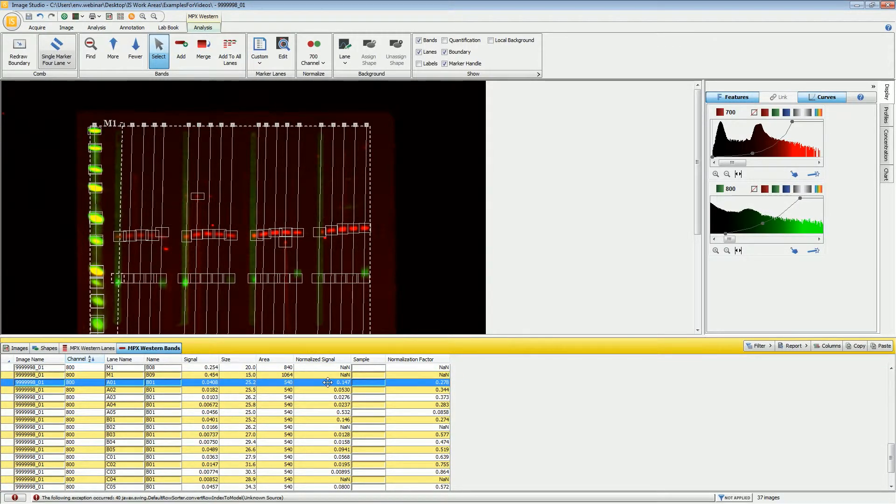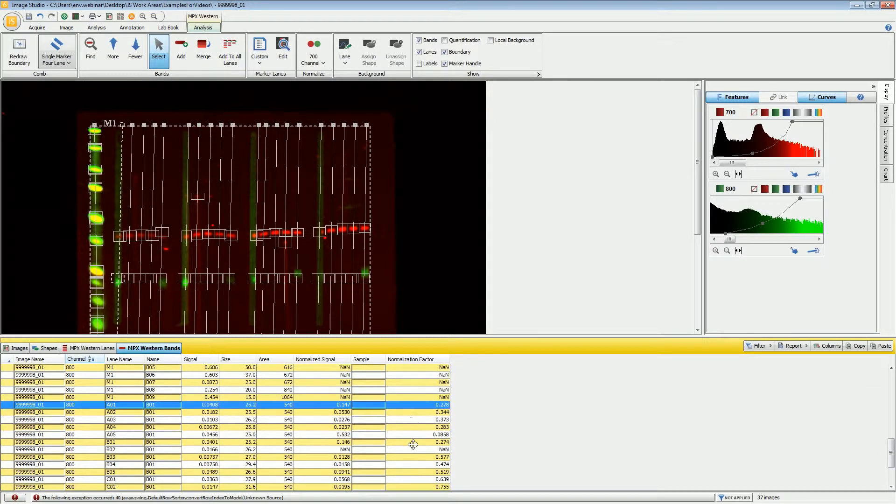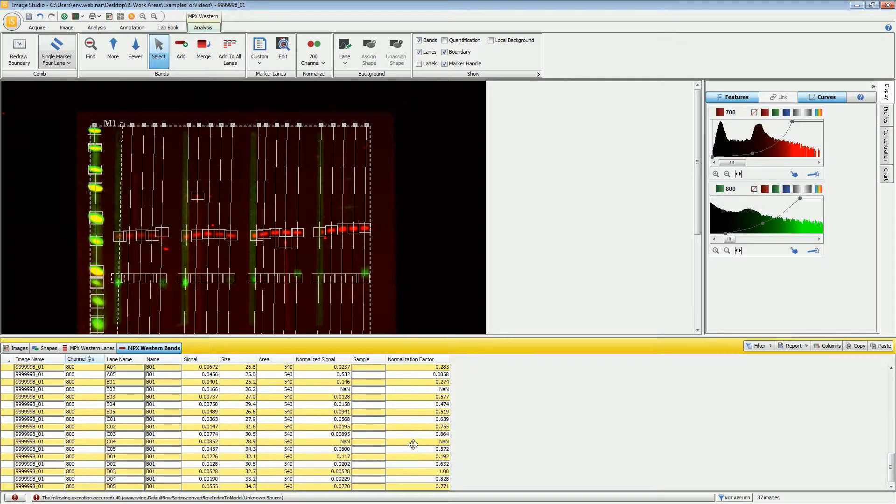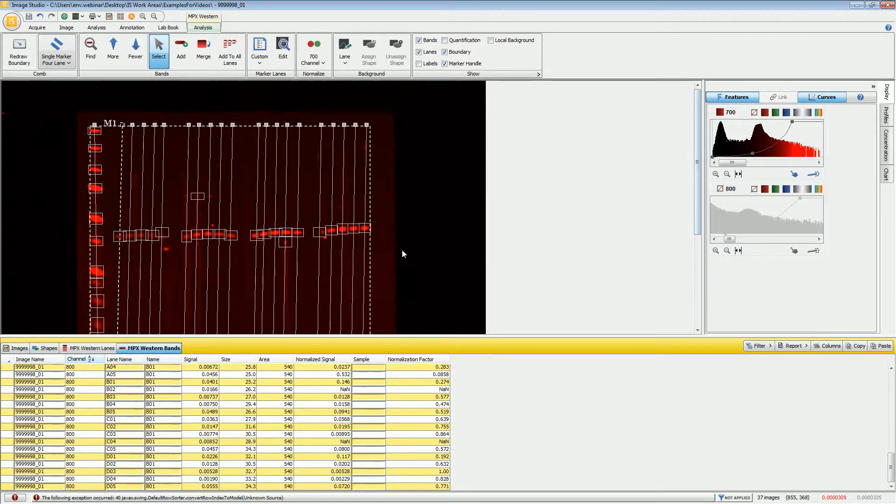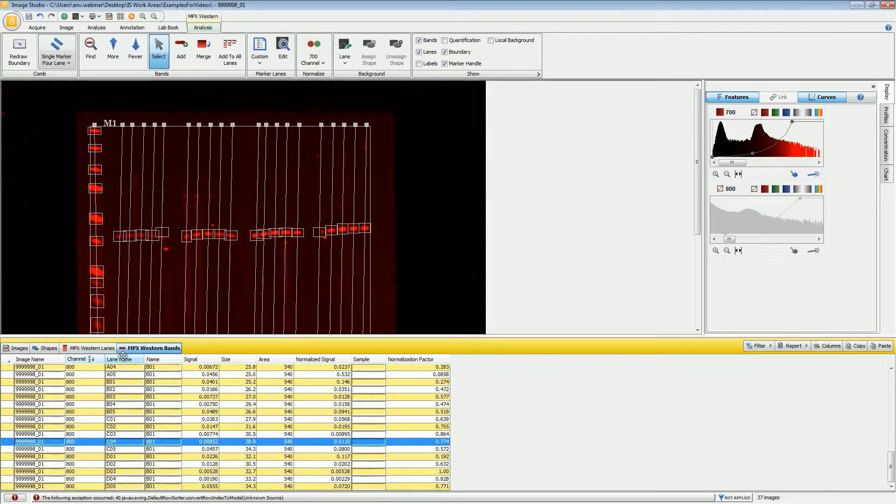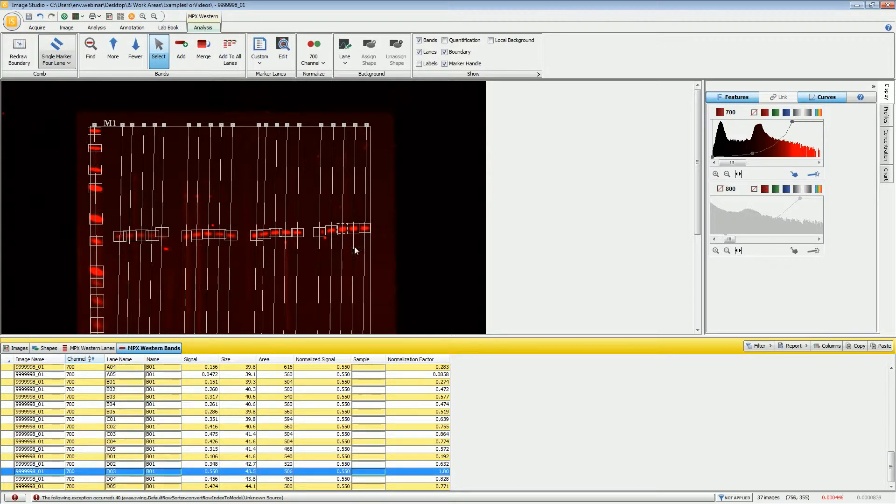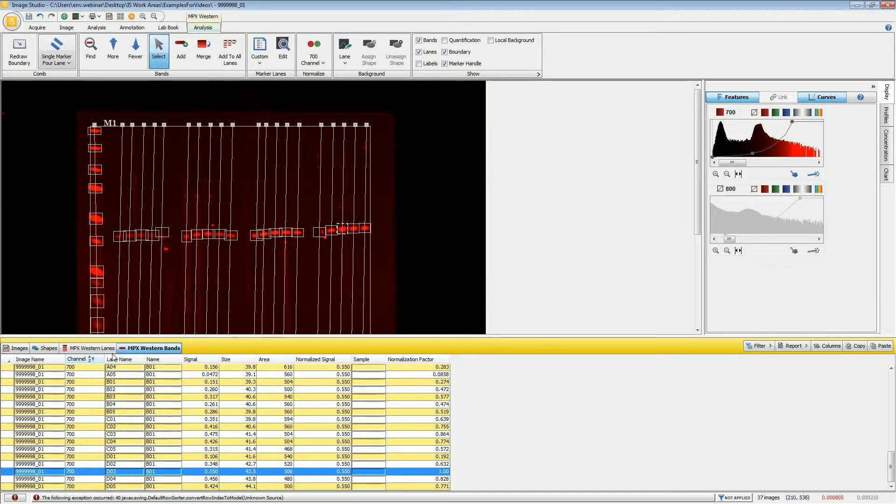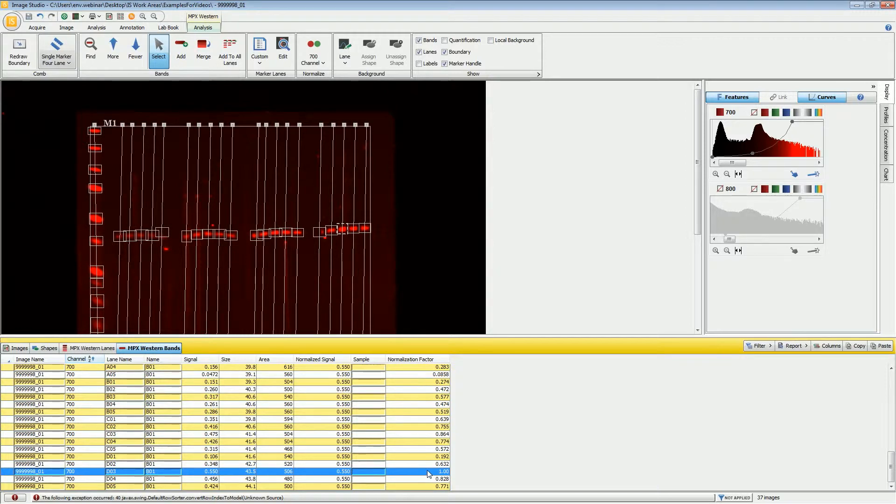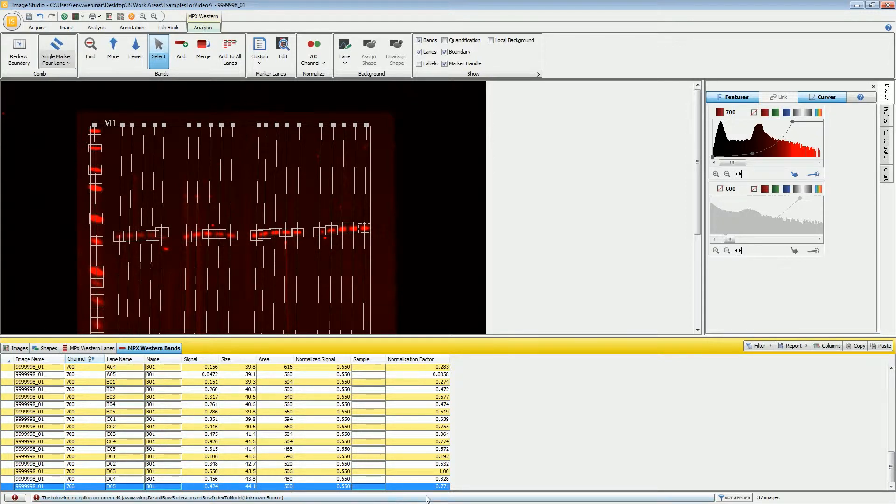Normalized signal is based off of a normalization factor. The normalization factor is determined by finding the band that has the highest signal out of all of the bands in the normalization channel. This band right here has the highest signal out of all of the bands in the 700 channel. Taking that signal divided by itself, it comes up with a normalization factor of one. It then moves on to all of the other bands on the image and takes the signal from that particular band divided by that highest signal to come up with a normalization factor.